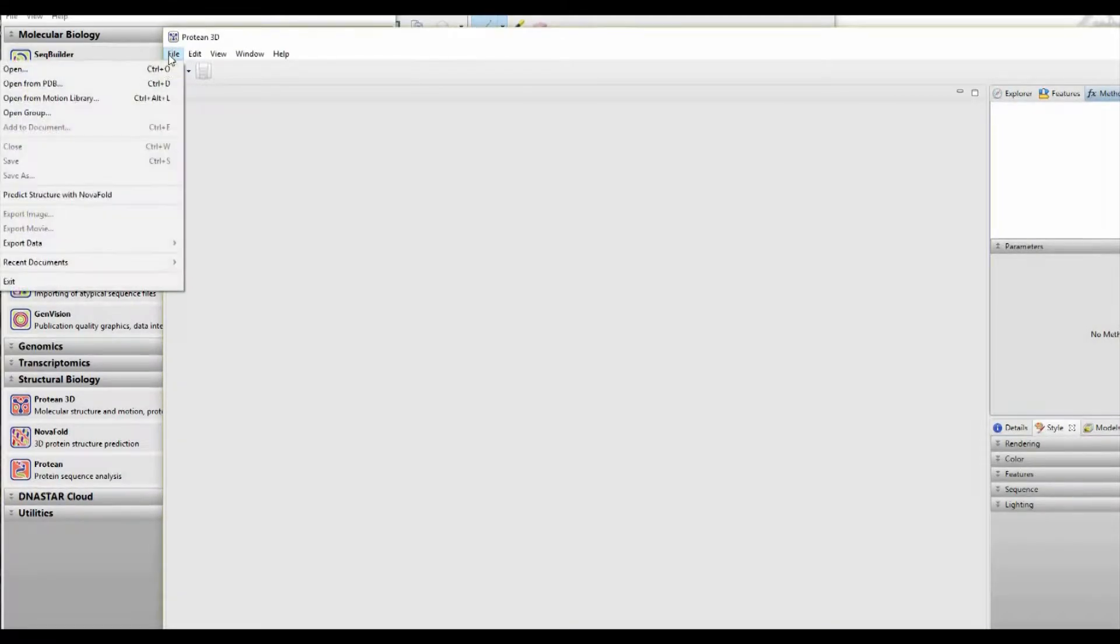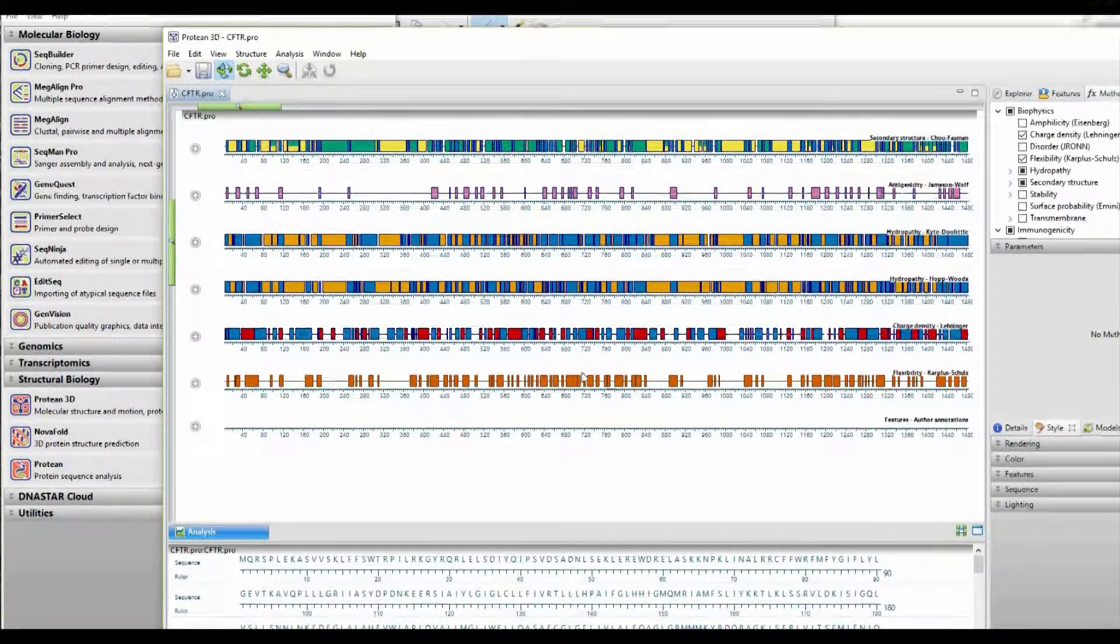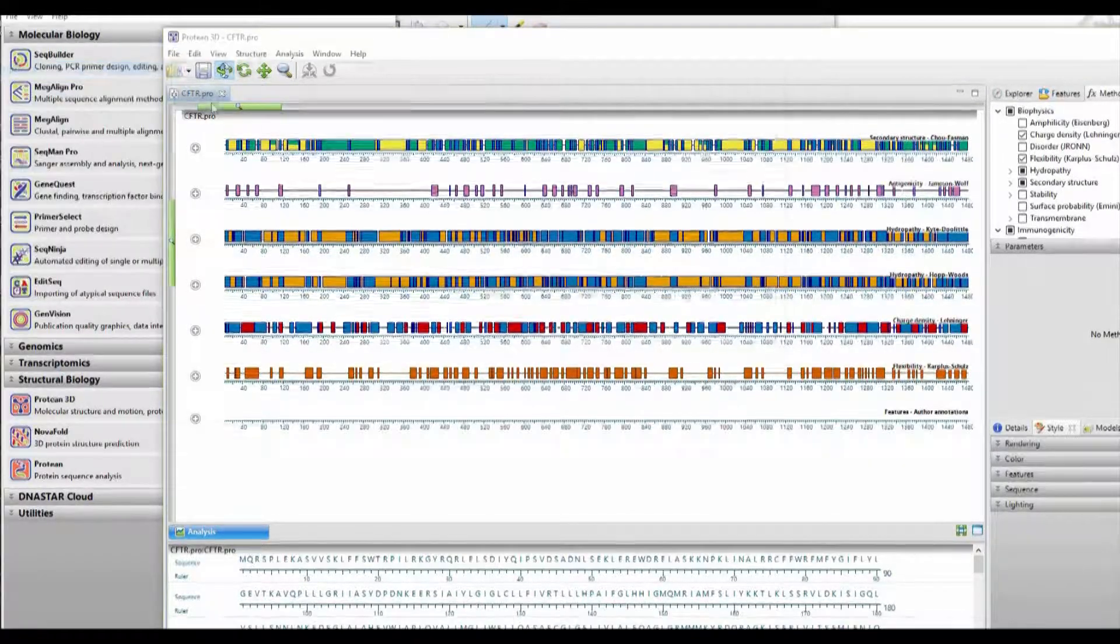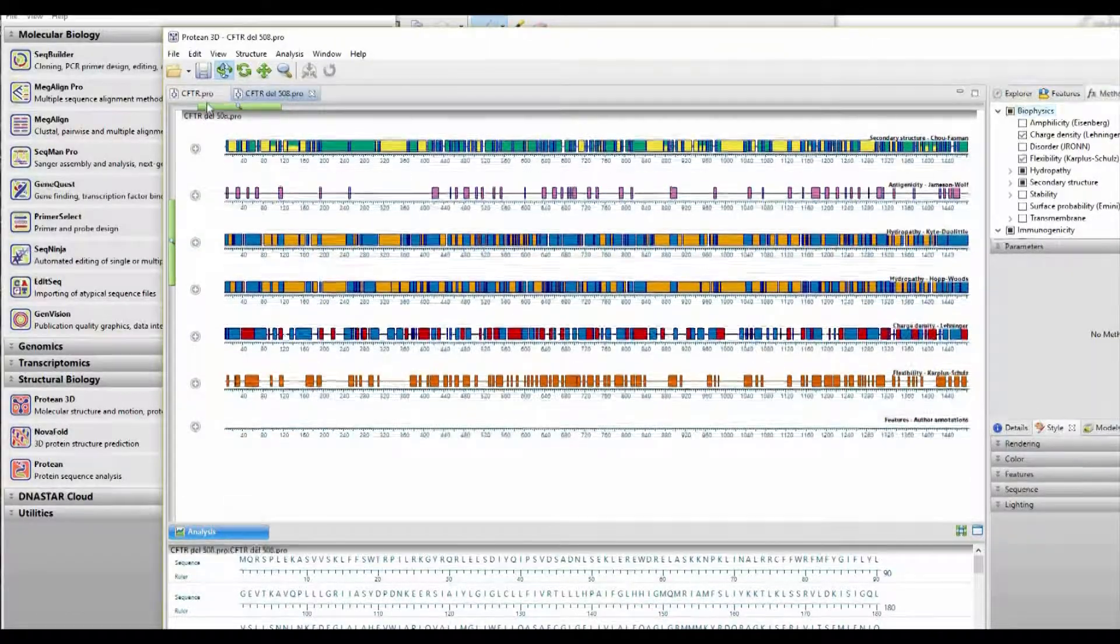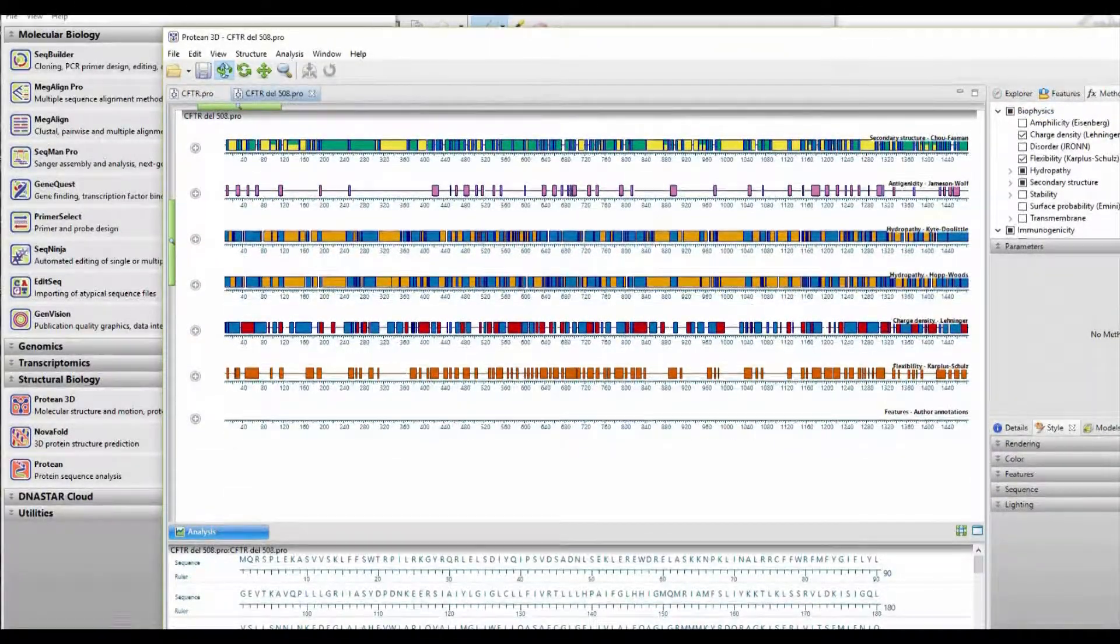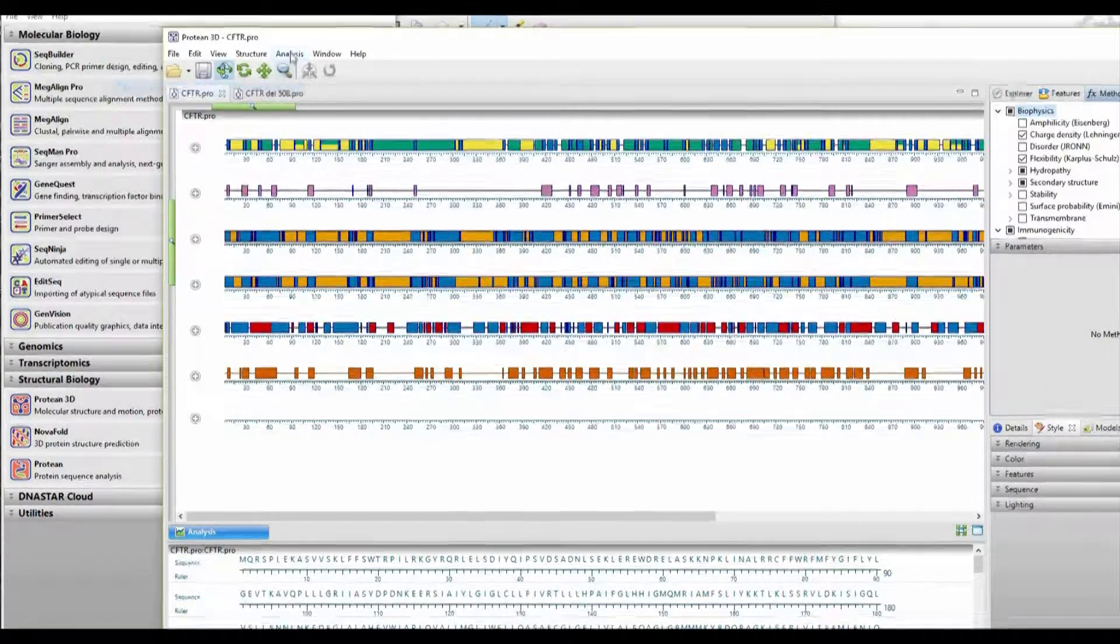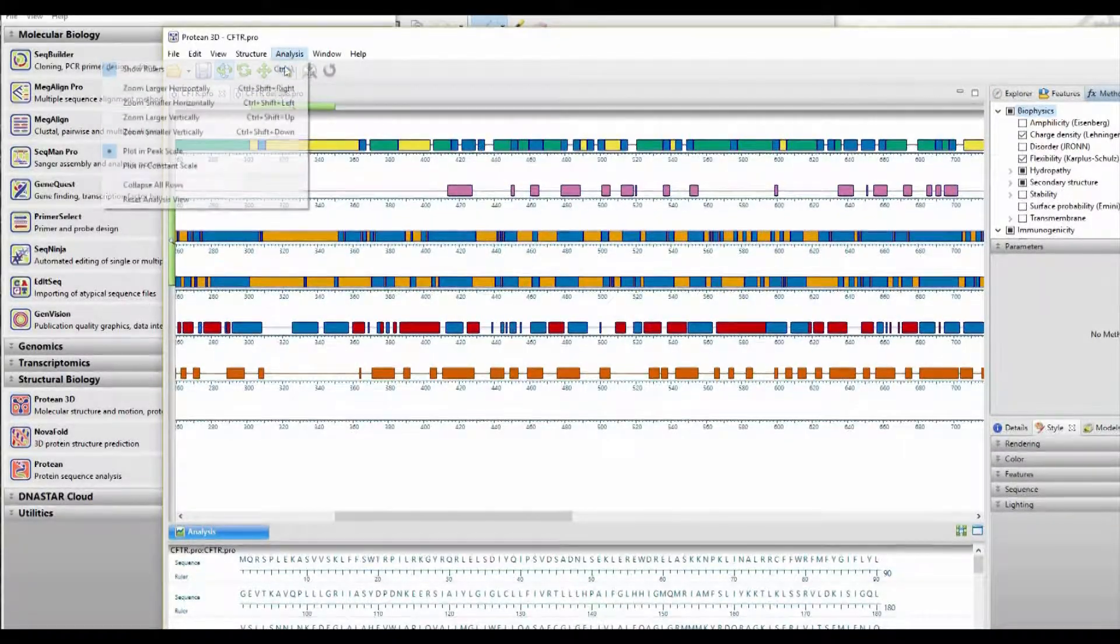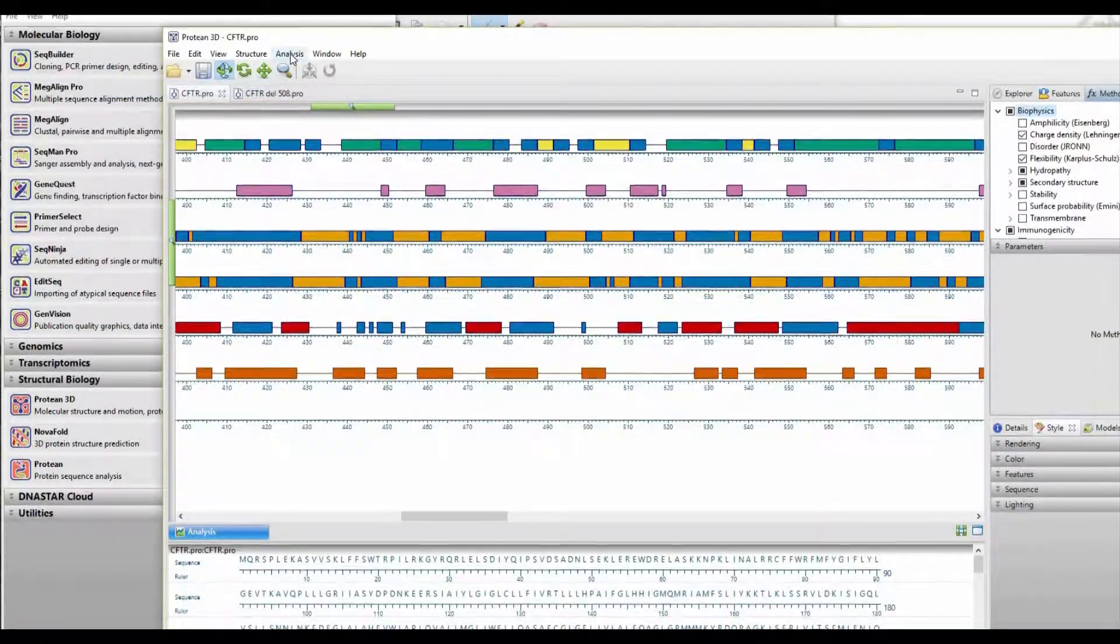So now let's open Protean 3D. First, we'll open the native CFTR sequence file, and then we'll open the sequence file with the variant in which del508 was removed. Each of these will receive its own tab in Protean. Now we'll spend some time zooming in so that the region between amino acid positions 500 and 510 is clearly visible in both the native and the variant protein sequence file.